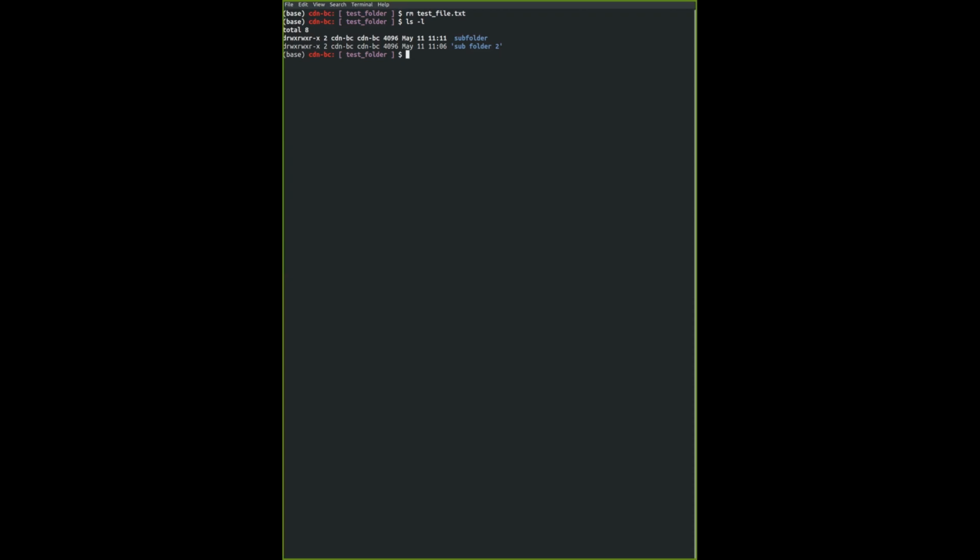So I'm going to delete this entire test folder that we created. I know it's a bit redundant to create and then delete, but it's a fun thing about being able to do things, where you can make and break things. We're going to remove the entire folder, but we are going to specify a flag called -r, which is short for recursive. It basically means do this function again and again until you reach the end, or when you have nothing else to delete. And we're going to delete the folder test_folder, right? Right, you ready?